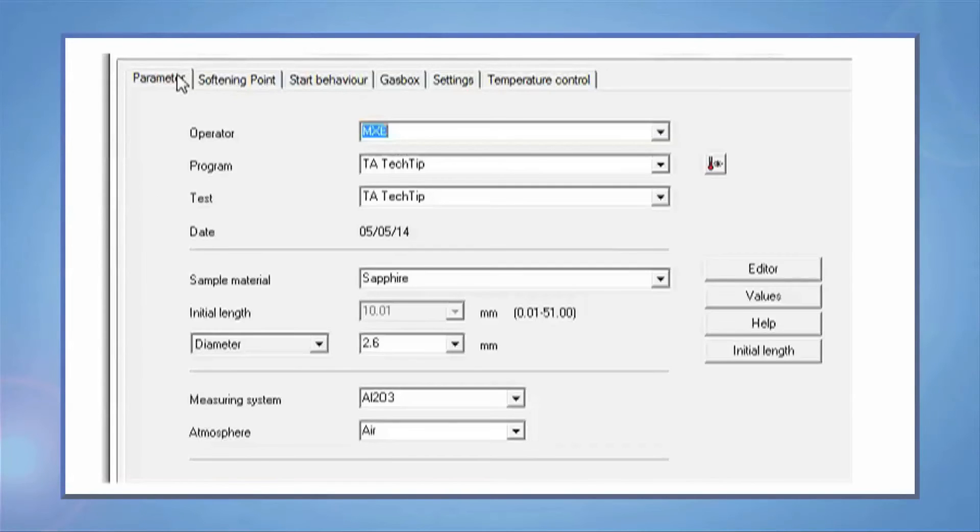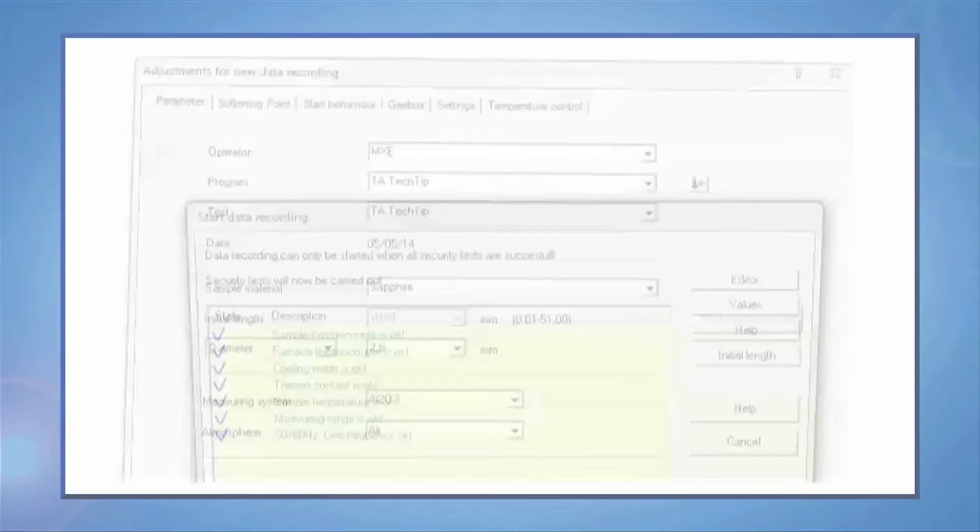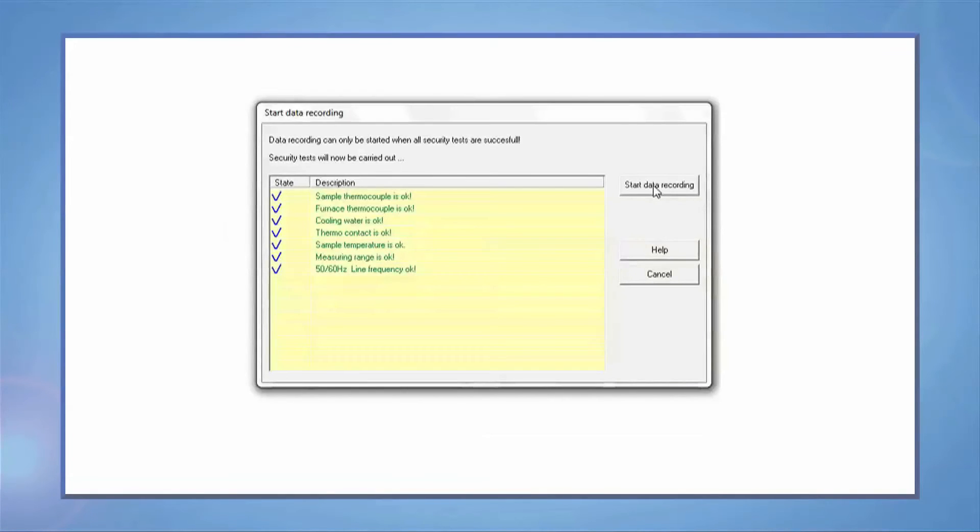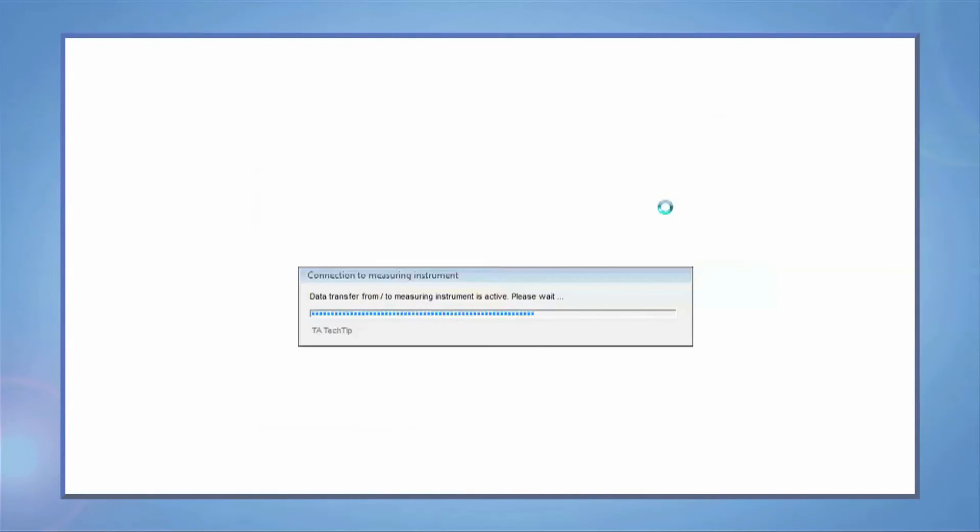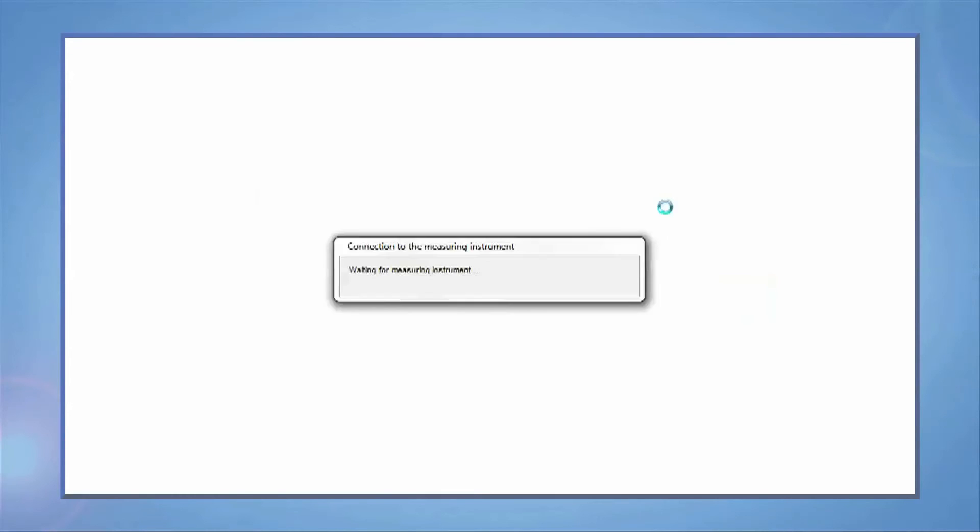Once you are ready to begin, press Apply and then OK. The instrument will do a final check to make sure everything is OK, and then you can select Start.